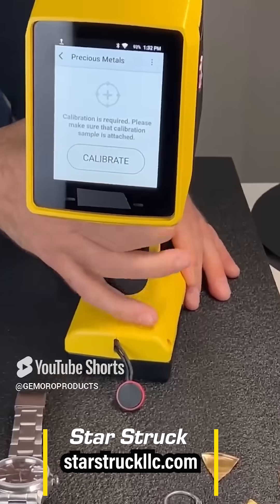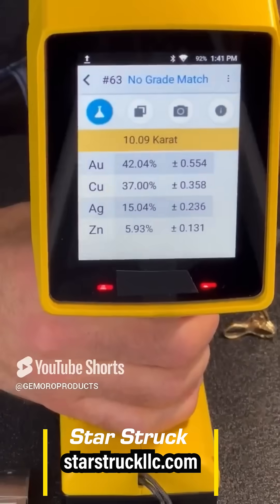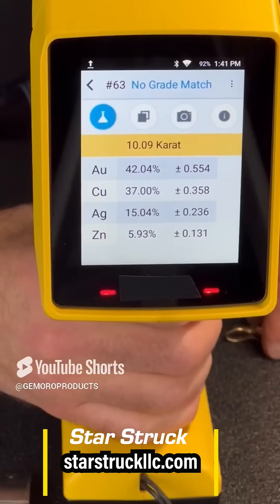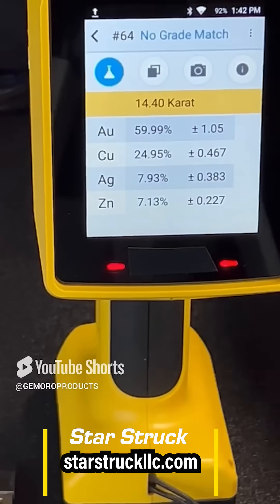It's fantastic for testing all your gold, platinum, silver, plated items, and even — it's got all your stainless steel IDs including 304, 316, and 904L stainless steel, which is Rolex's signature metal.